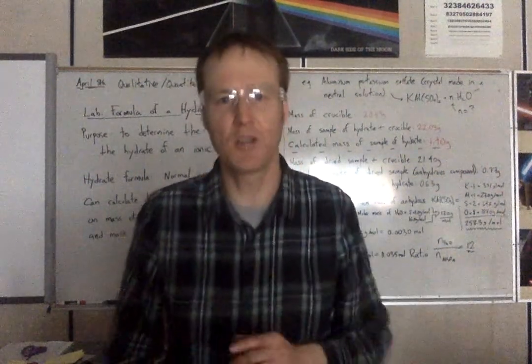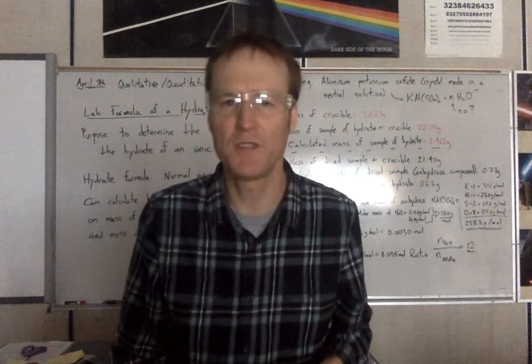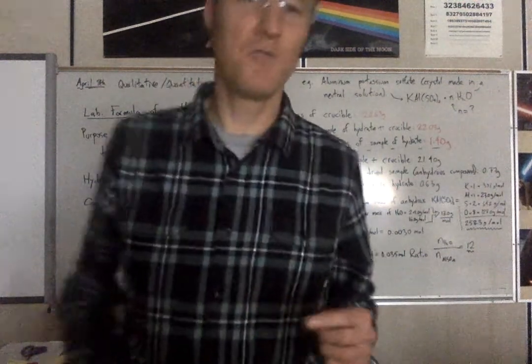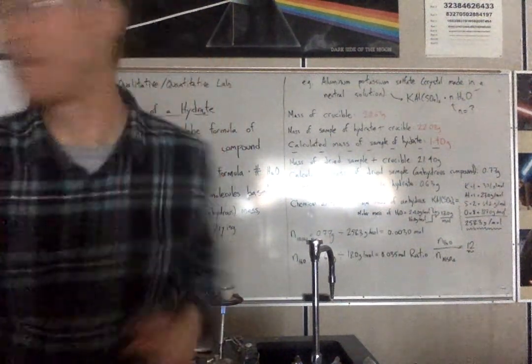Was any mass being lost from a crystal while I did that? Maybe a tiny bit. Is it likely to affect the results? I don't really think so, because it's really small amounts of the salt that are always involved in those kinds of reactions. Let's get the lights back on. We'll have a look, see what's happening.